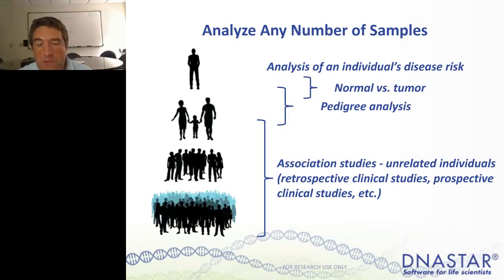We'll have some new options as well for these larger projects. If you are someone that's doing association studies and you've got 100 exomes that you have to do, we have some other options that will be available later this year. Things like assembly up on a cloud, where you can use cloud resources to handle these really large data sets. So that's something to keep in mind.